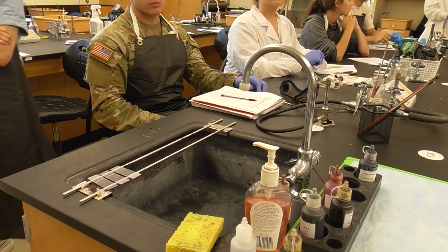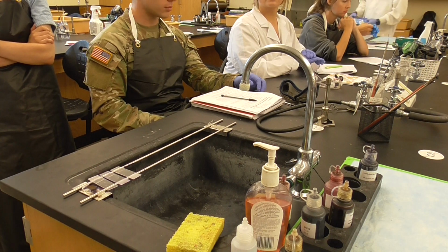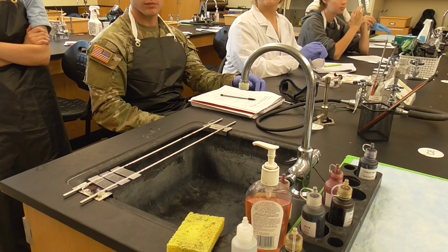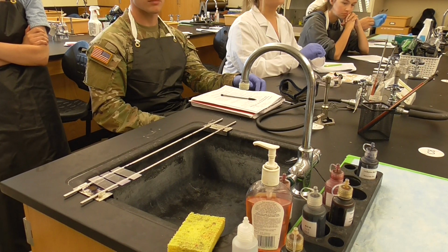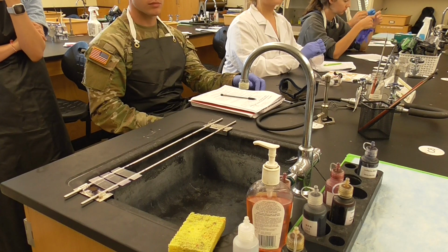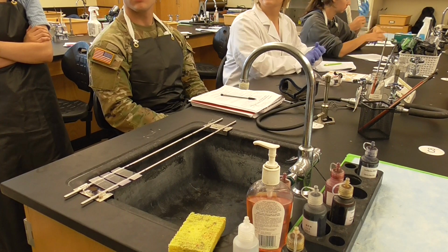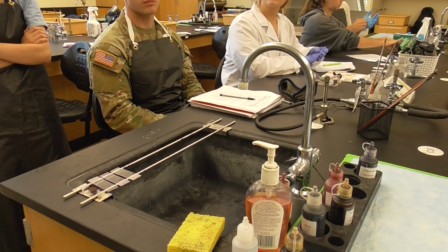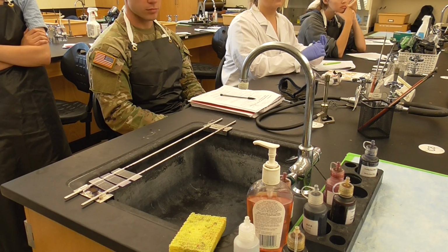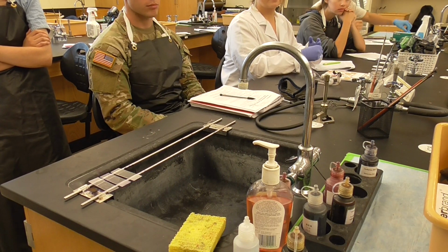Okay, I need glass slides, which can be found. I have some. I'll use one. Can you also get your tray? Yeah, it's right here. Okay, that's good. I need to borrow the Sharpie marker.